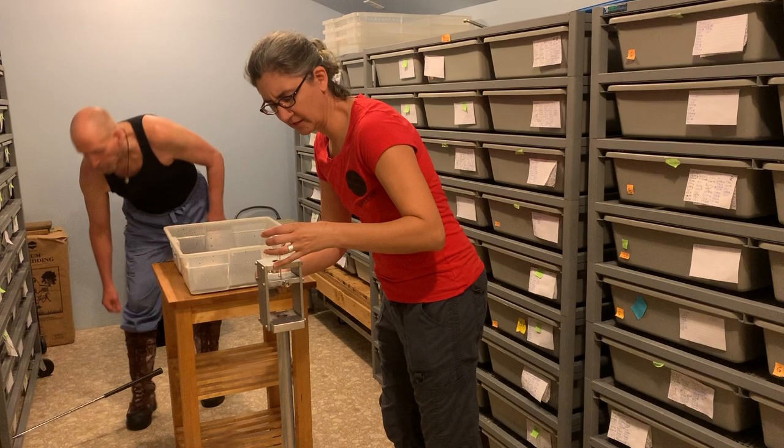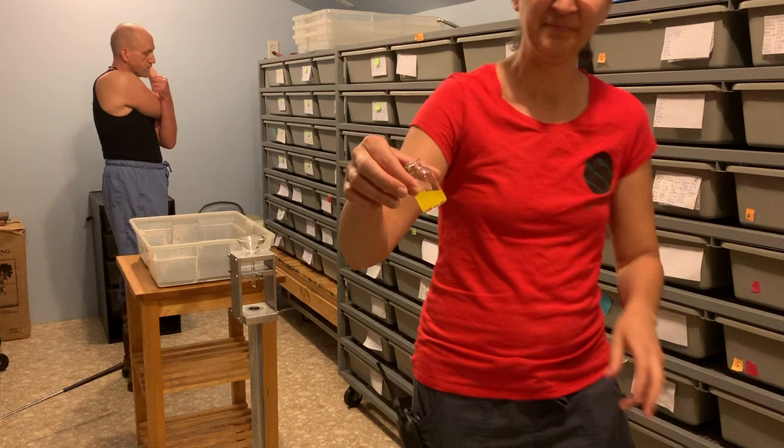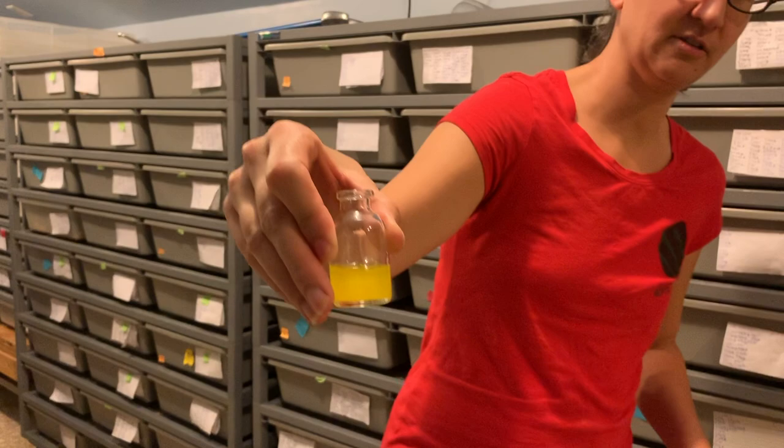We don't let these vials get too full because when we do they'll break in the freezer. That's what the venom looks like, and then I'm going to just switch out this vial.